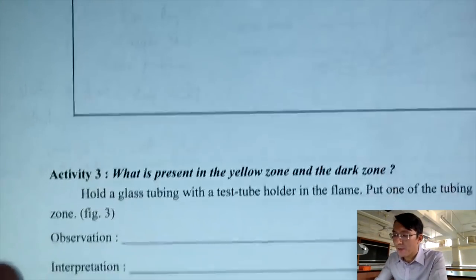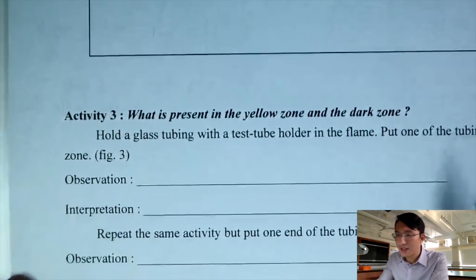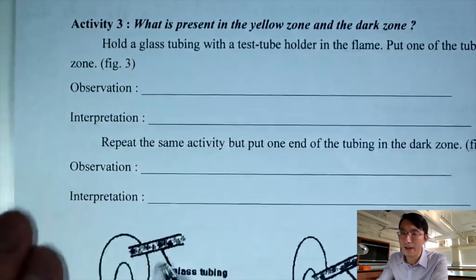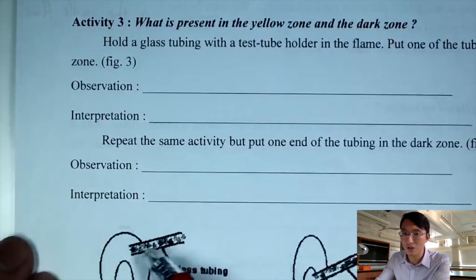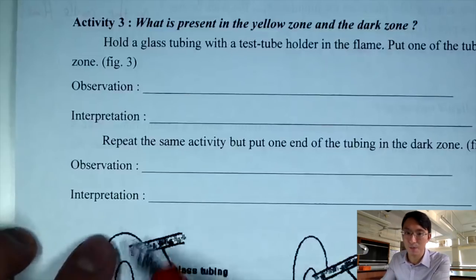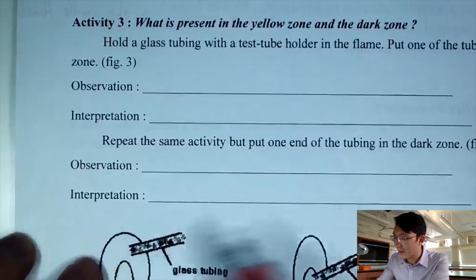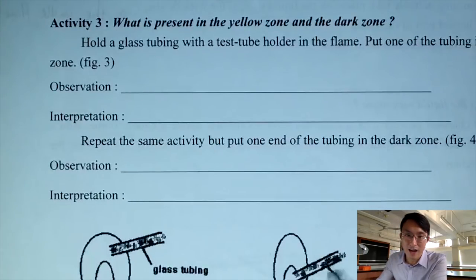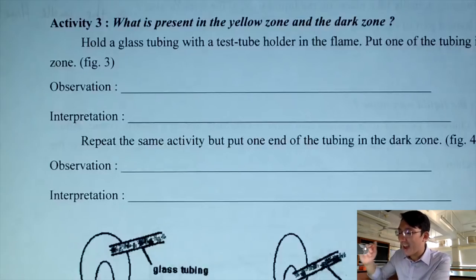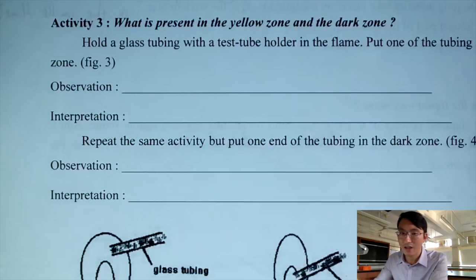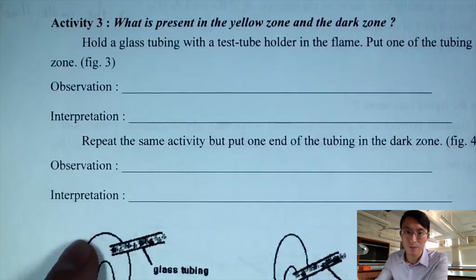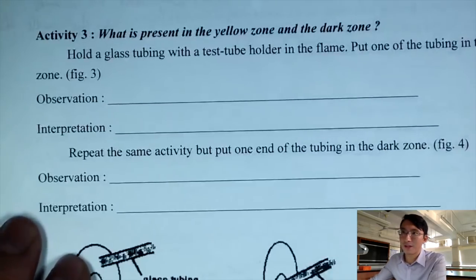For activity three, we use a glass tubing to try to get some gas or smoke out of the two zones — the dark zone and the yellow zone. We put the glass tubing first into the dark zone to see what kind of gas or smoke we can get. After that, we put the glass tubing into the yellow zone to find out what color of smoke we can obtain.